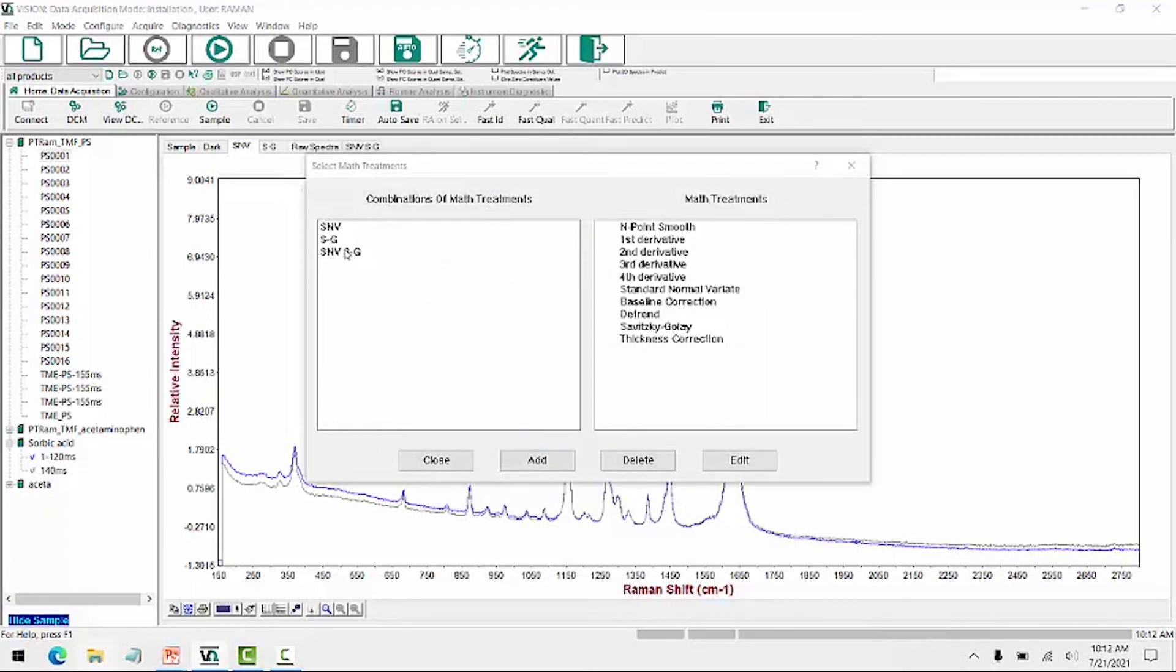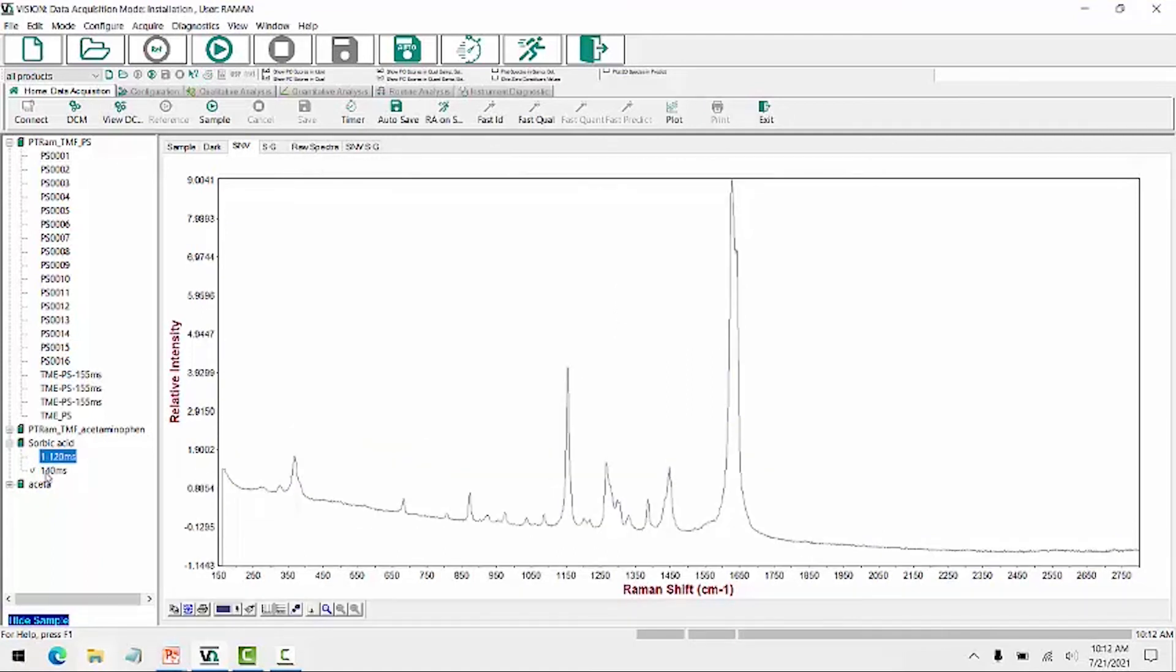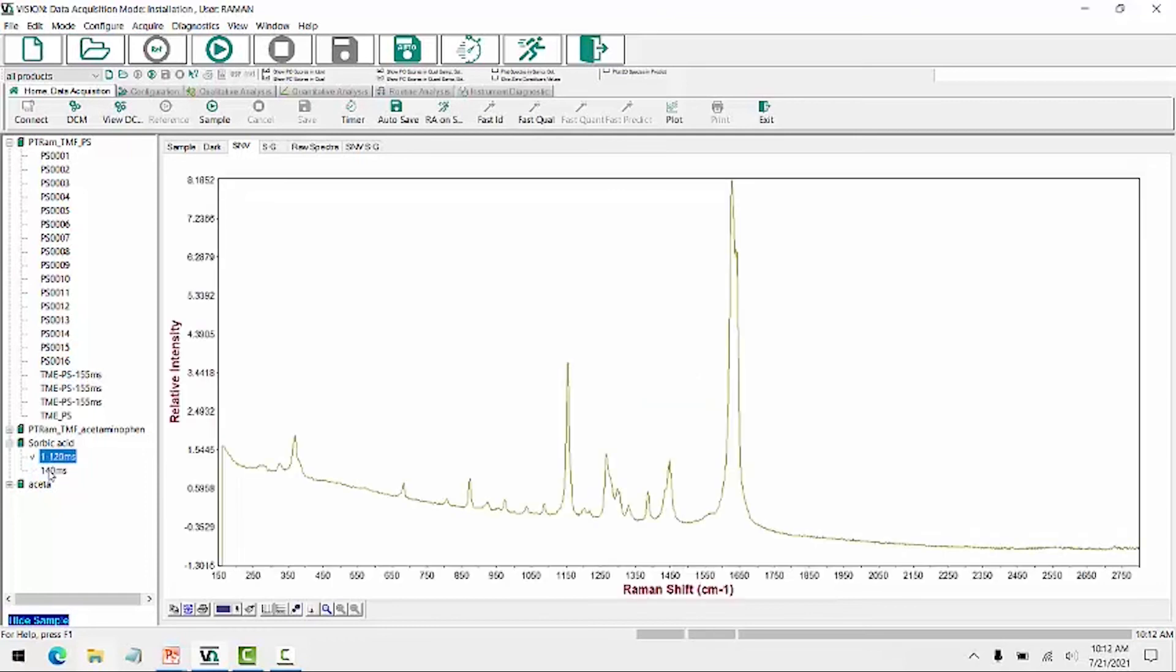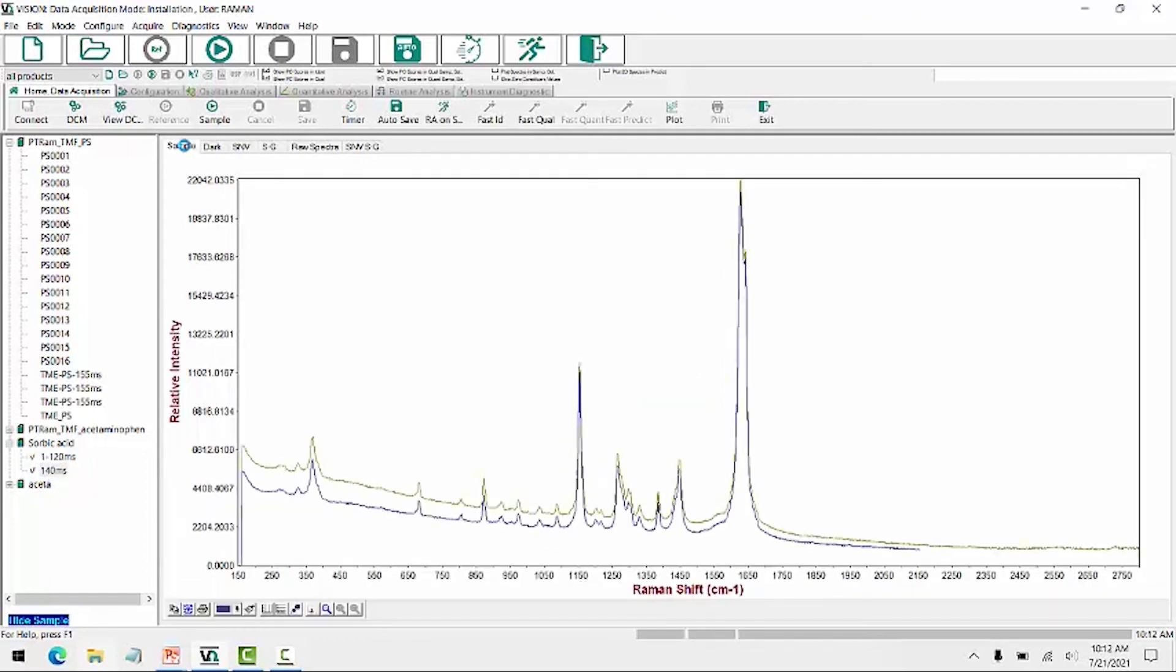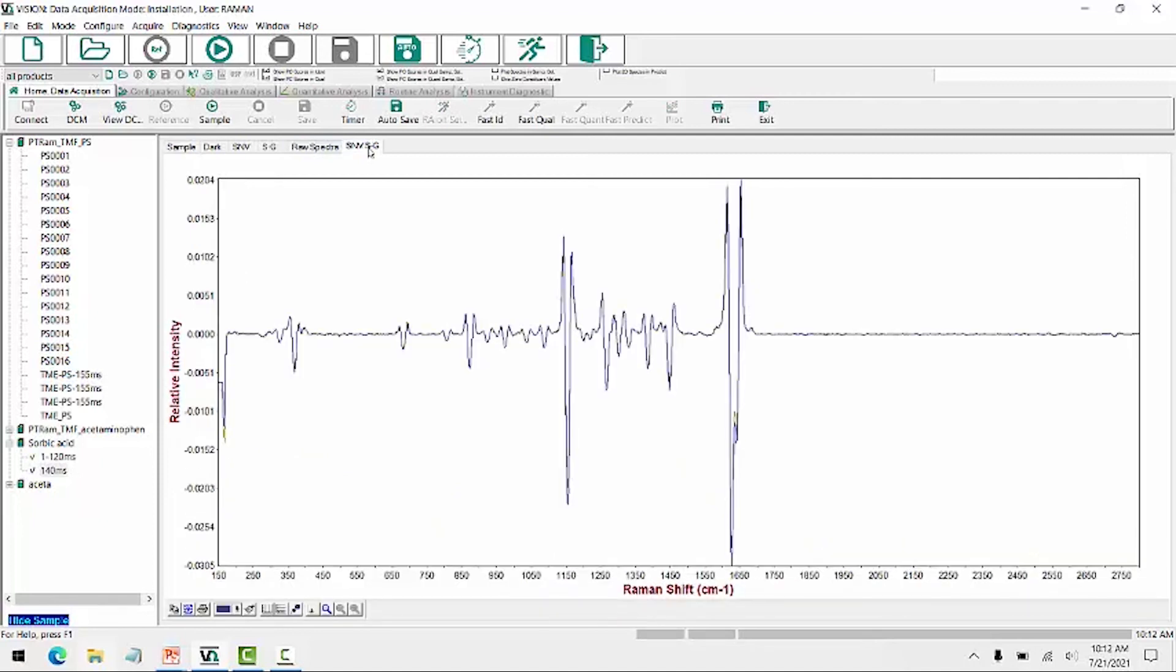And here is my additional preprocessing that's now been added. Whereas to see that live, I need to reselect my spectra. So these are my raw data. And this would be my SNV plus a second derivative of those same two scans.